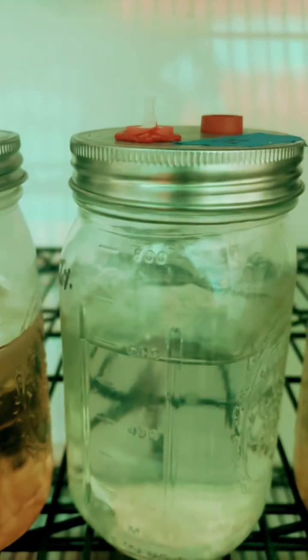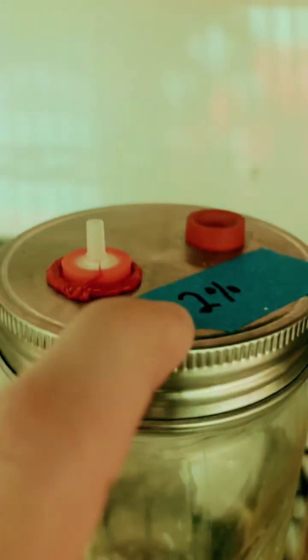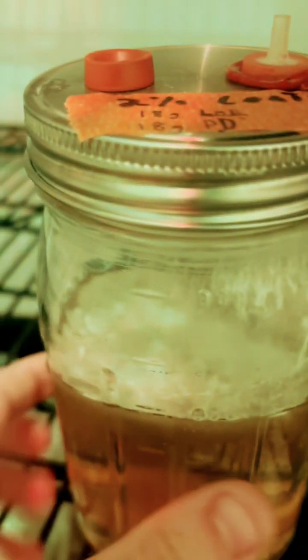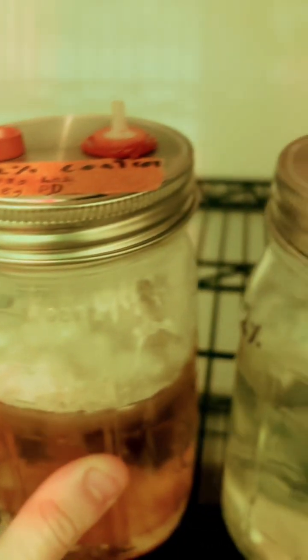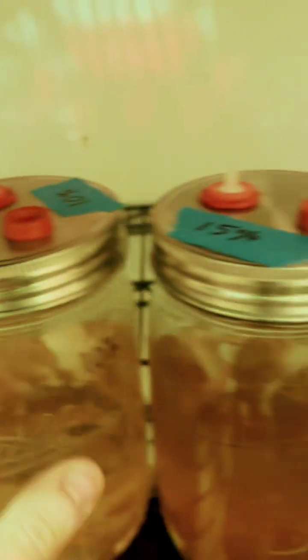So honestly the best results I'm seeing are between like 2% and 10%, and maybe even lower than 2% as a concentration might give me results more like this one. I am not sure but further testing is needed.